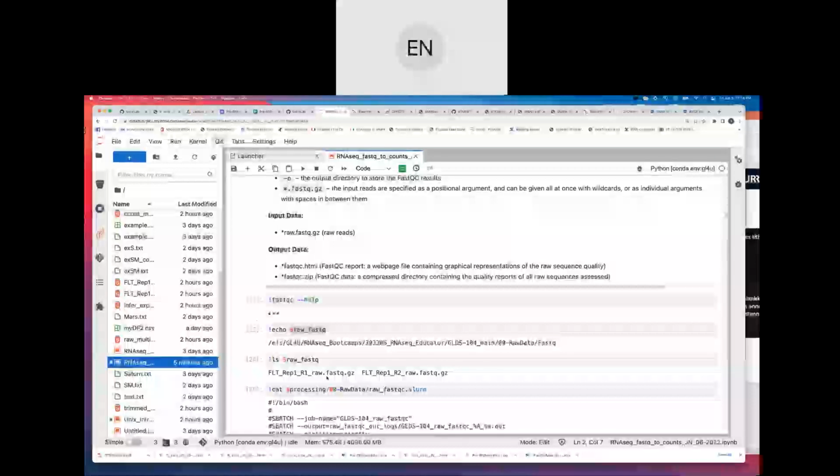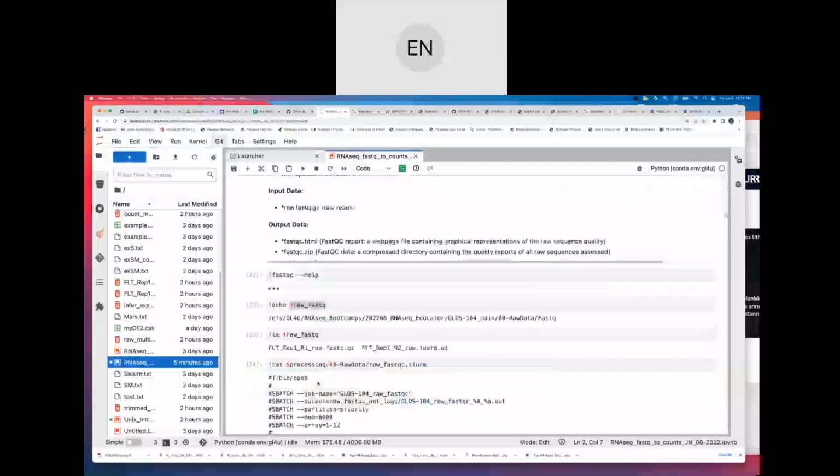Thank you. It's still running, I think. I'm not as far along as you. I got bumped out of the web, but not off Jupyter Notebook, so I don't know how that happened. But anyway, keep going. I'll catch up.